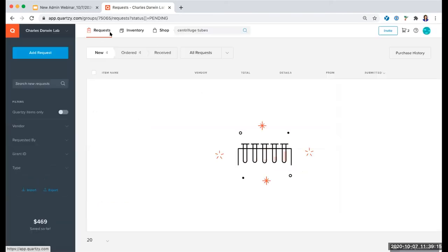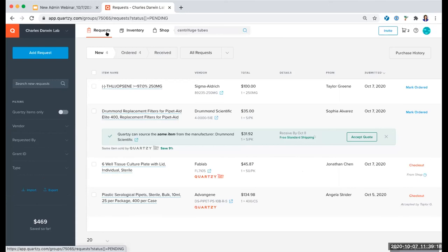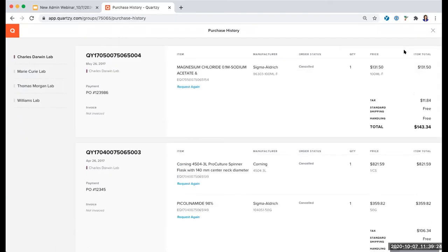If I click on the Q logo, that's going to take us back to the request table. After all of your orders have been placed, you can view them in the Purchase History. This is also where invoices will be available for you to download — they'll show up under the Invoice section as a clickable link with the invoice number. Remember that for all items that show up in your purchase history, Quartsy would be the supplier, so you can reach out directly to us with any questions about order status or if there is an issue with an item once it arrives.